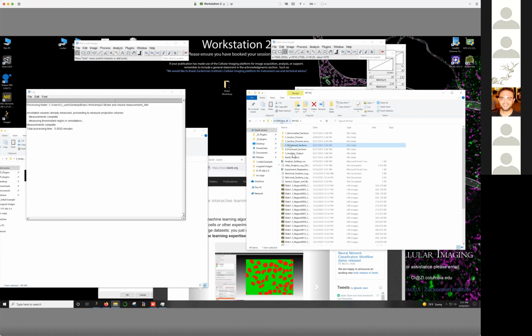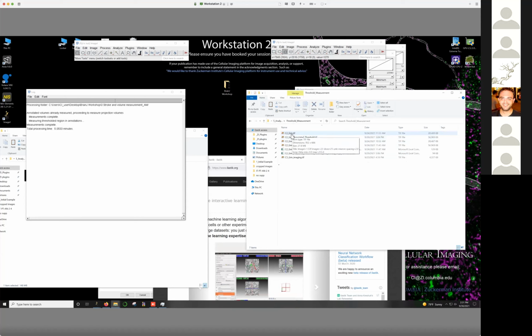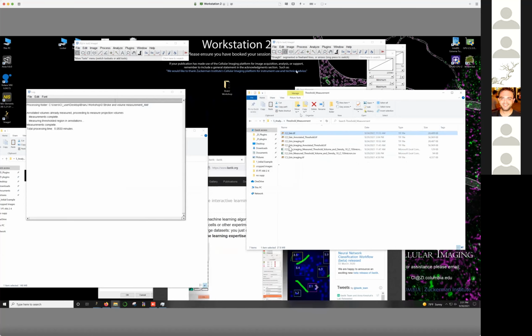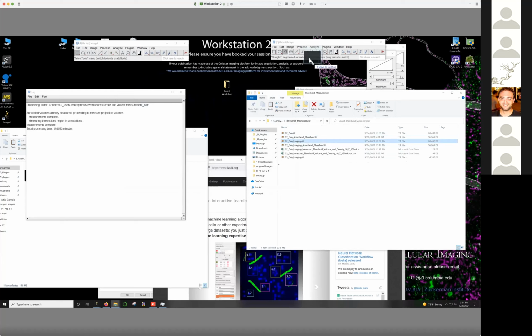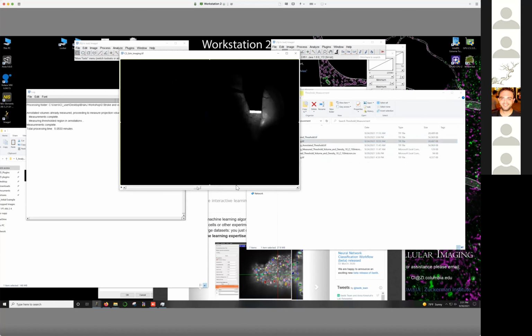And if I look in here, this is where I've actually done this already. So here I've got the GRIN lens. I'll just quickly show you. So you can see where I've done this, and also looked at the 300 micron sort of depth that we get using these lenses. This is just an approximation just to demonstrate.